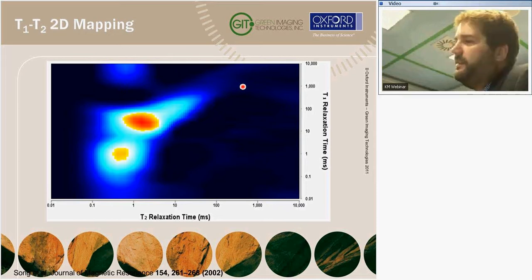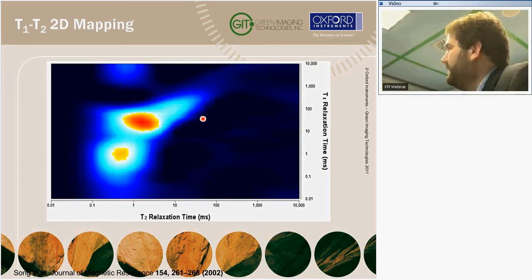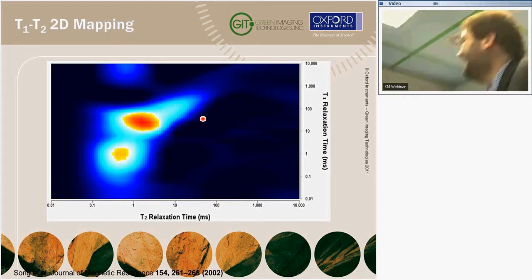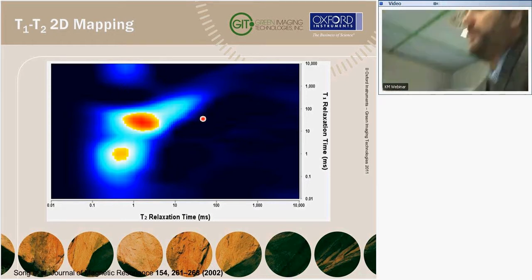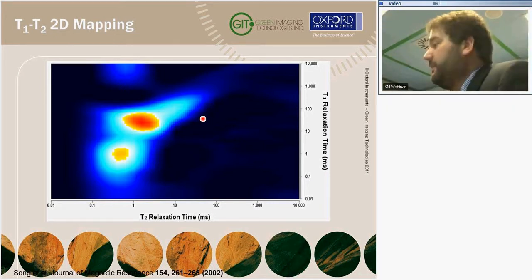But you could do a laboratory experiment. I haven't done that, where you just introduce gas into this rock in a pressure cell and look at the signal. Yes, so the important point is to try to reproduce the reservoir conditions, because otherwise maybe we can misinterpret the results. Yeah, reservoir conditions are very, very important, especially when dealing with gas.